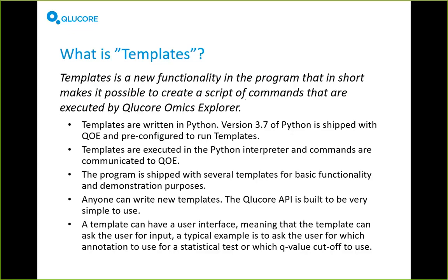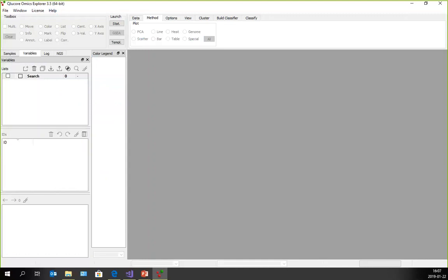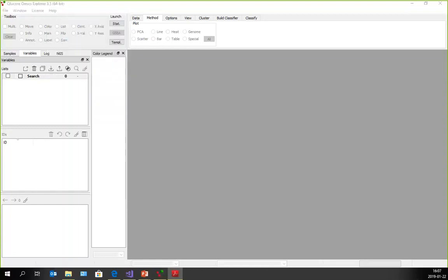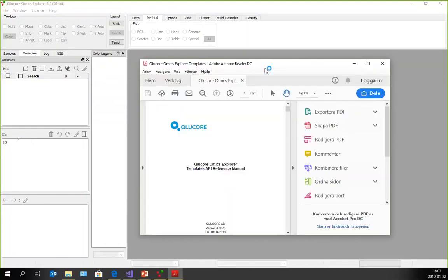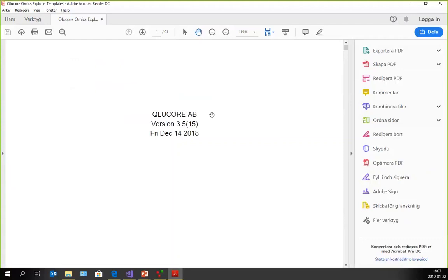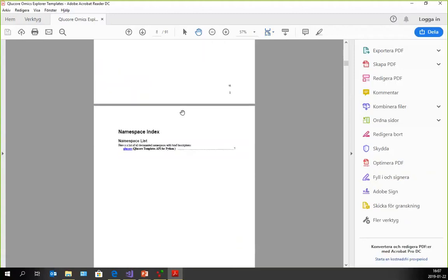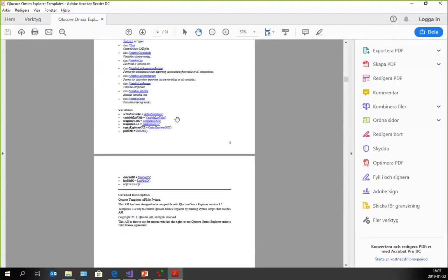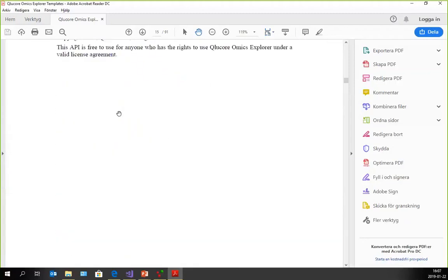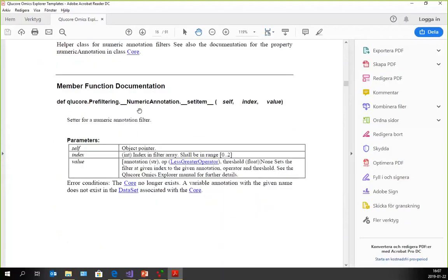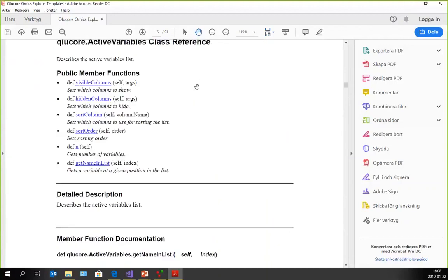The API we've published is built to be very simple to use. In the help menu there's a new item: Template API Reference Manual. If you click on that it brings up the reference manual. This is generated through Doxygen and gives you all the details you need. The easiest way to get started is to try out the example templates, but there is full documentation of all the details available.